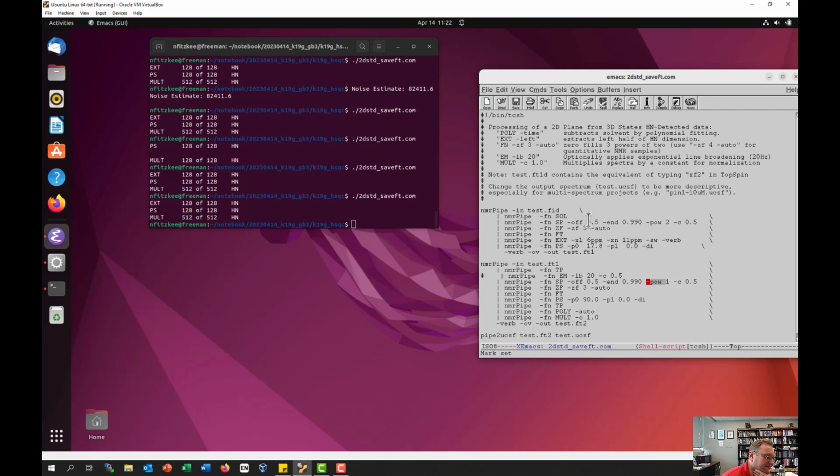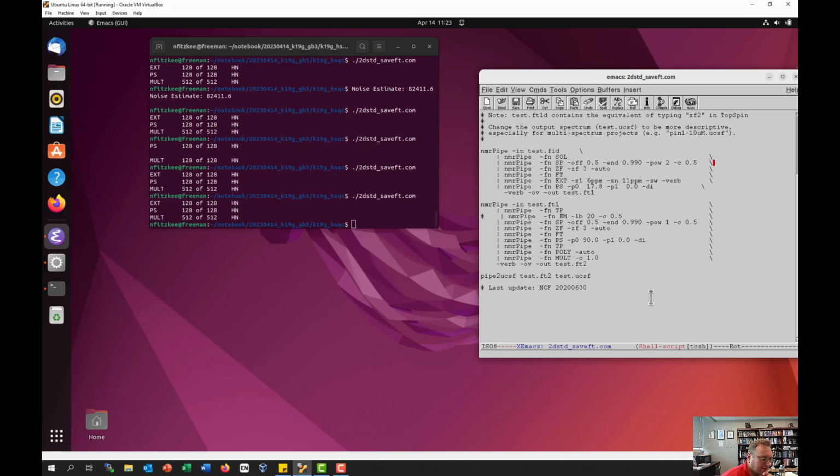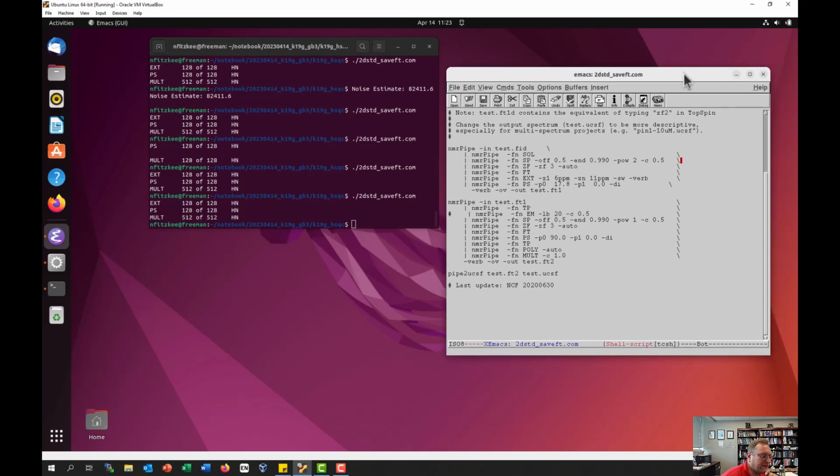So this starts midway through a sine wave, and so it starts high and then ends close to 0. And then this starts high and it ends close to 0, but it scales down as a pure sine, whereas this one is sine squared. Don't worry about that for now. Again, you should take my NMR class. You will take my NMR class eventually, but we can talk about and look at those differences here. Most of the time, for just general looking at spectra, you can leave these alone.